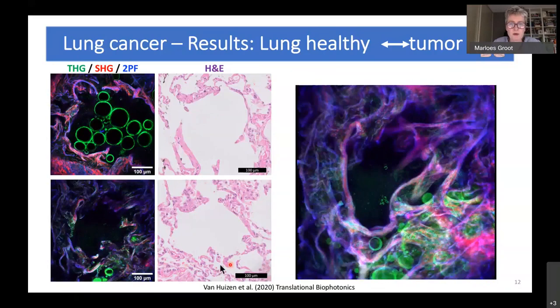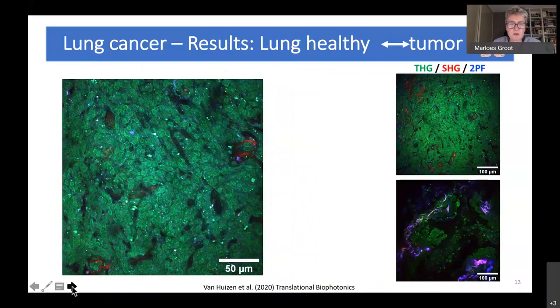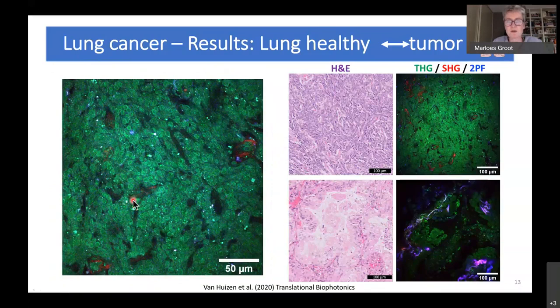Now, when we look at the tumor sample, the appearance is much different. So now we have a lot of green signal. That's the third harmonic signal. This whole alveolar structure has almost completely disappeared, and the volume is now filled with cells, which give this green third harmonic signal. You can look at that, but you can also zoom in and then inspect the shape of the cell nuclei, and also look at the growth pattern of the different cells. This allows you to really diagnose the type of tumor that we have here. So this is, I think, an adenocarcinoma, and this is something else of which I forgot the name.